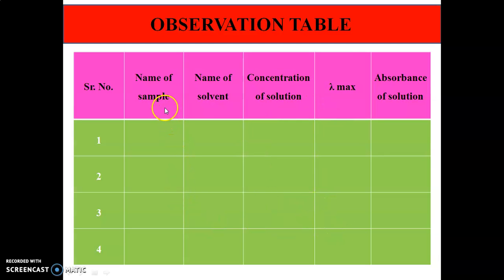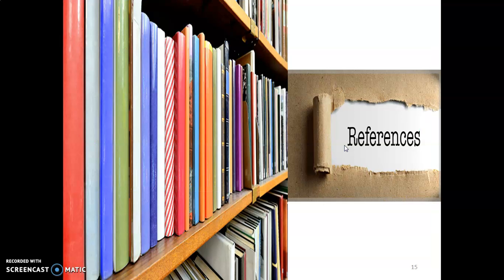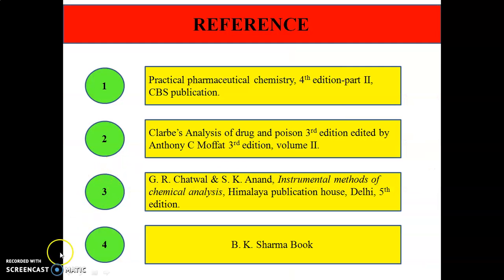Here we have to fill this observation table. The lambda max and the absorbance of the solution, these two values you will get from the UV spectrophotometer. And then you have to write down the results and conclusion. So these are the references.